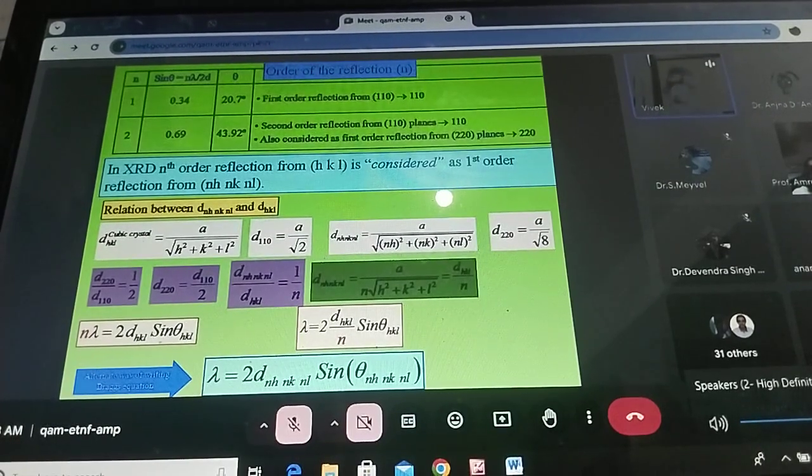If I write titanium, it will pick the atomic scattering factor for titanium. If my results do not converge, then I will replace it, because whatever structure I solve, I have in my hand what chemical reaction I have done, with whom, and what constituent solvents or compounds I have taken to synthesize a particular compound. So I have to feed the formula.